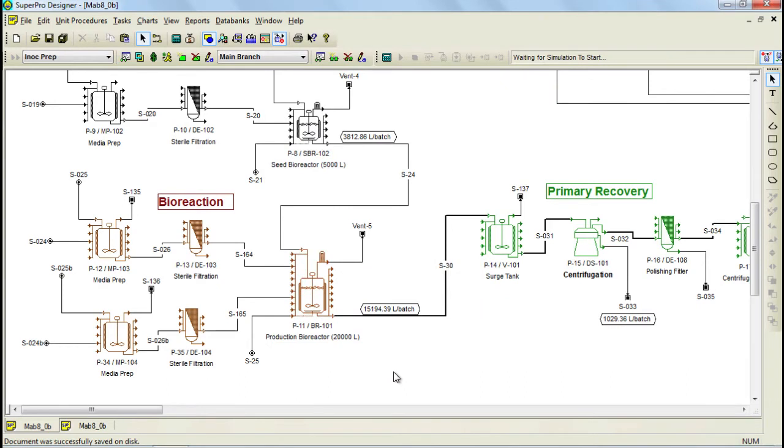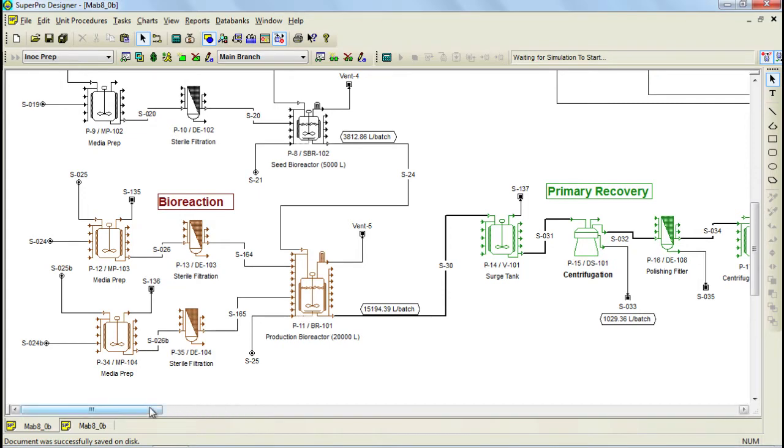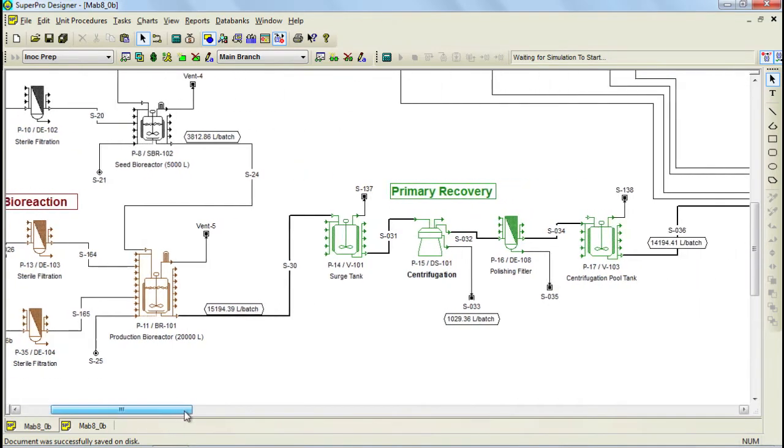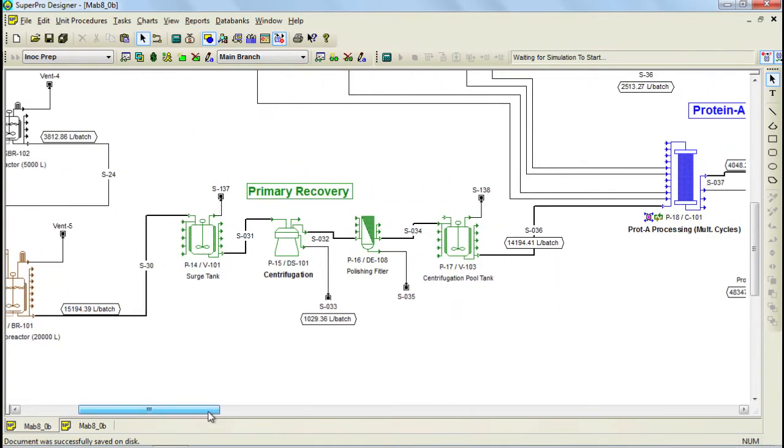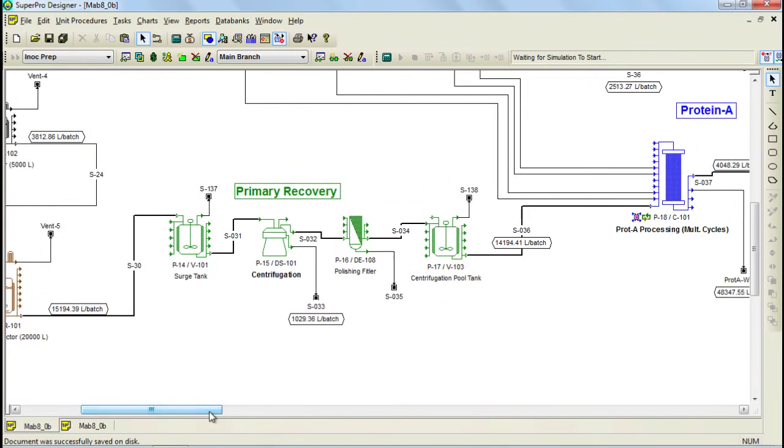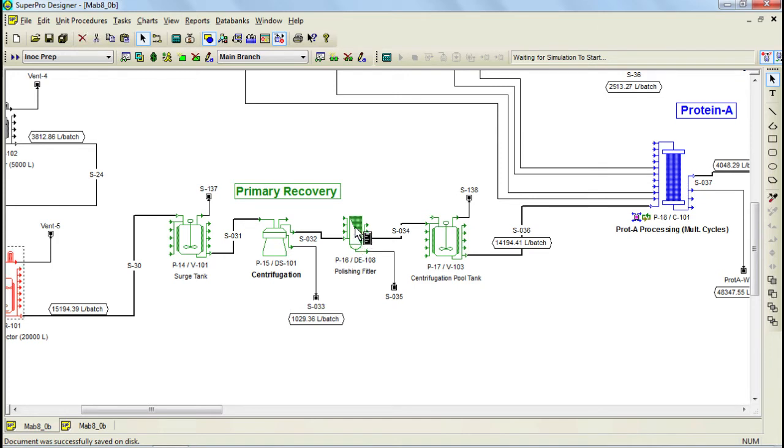At this point, I would like to mention that perfusion processes can also be modeled with SuperProDesigner. Continuing with the example, after fermentation is finalized, the broth is sent to the primary recovery section for clarification. Clarification is carried out using a disk stack centrifuge and a dead end filter to remove the remaining biomass.